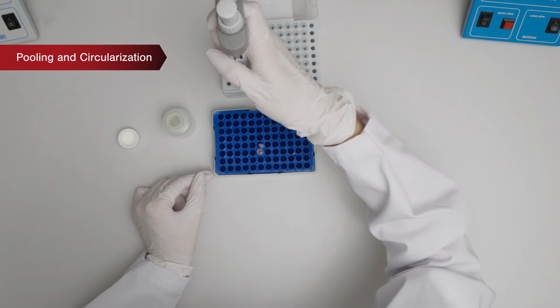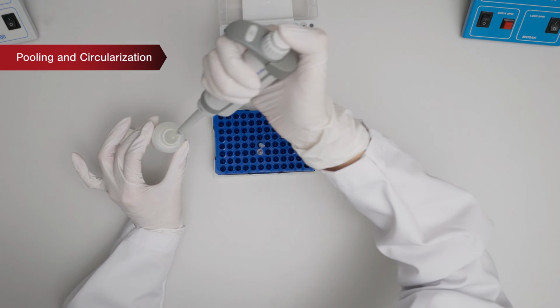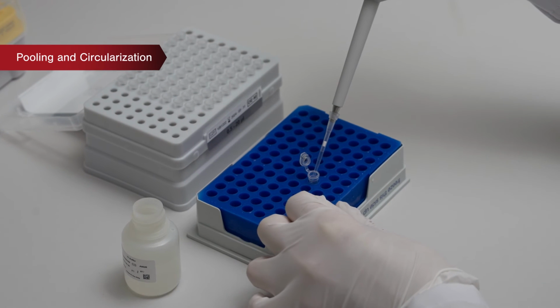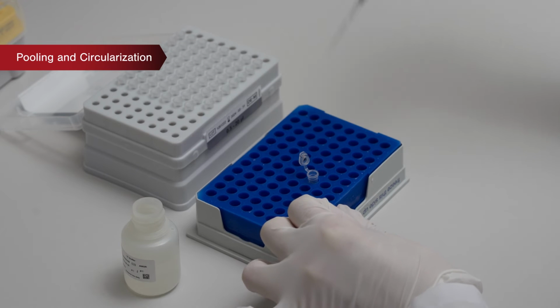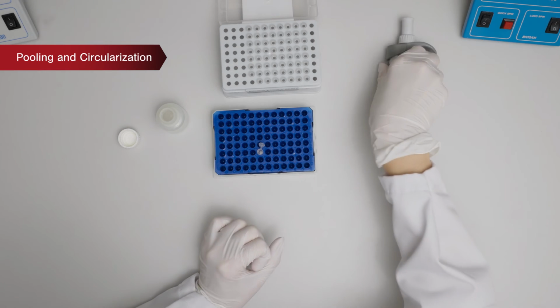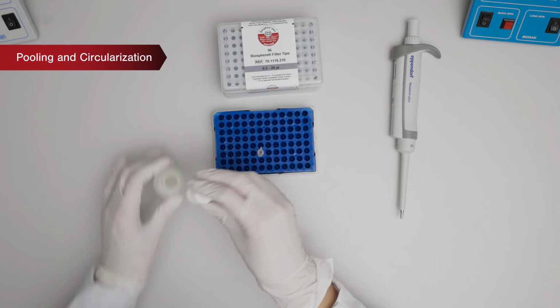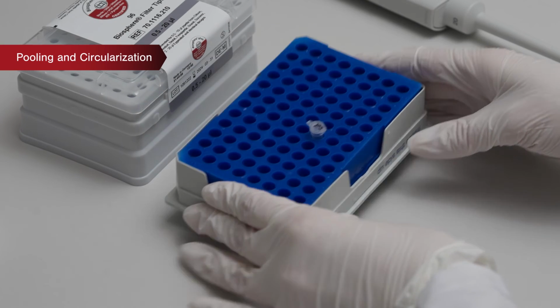Circularization is started with the denaturation stage, during which DNA strands are unwound. We transfer 48 microliters of pooled samples in a 0.2 milliliter PCR tube and put it in the thermal cycler in the following conditions.